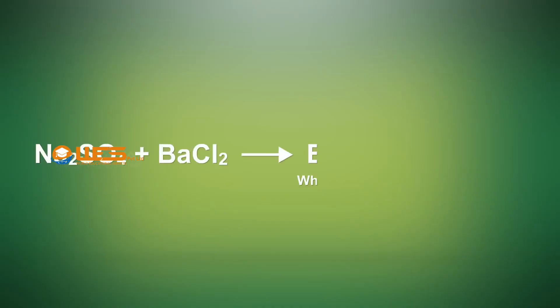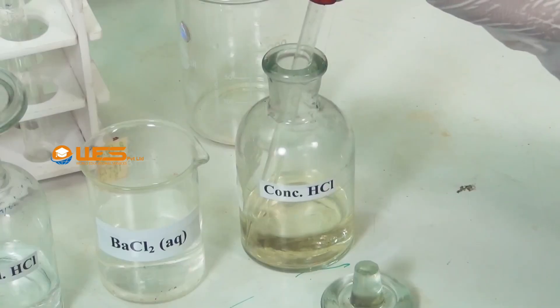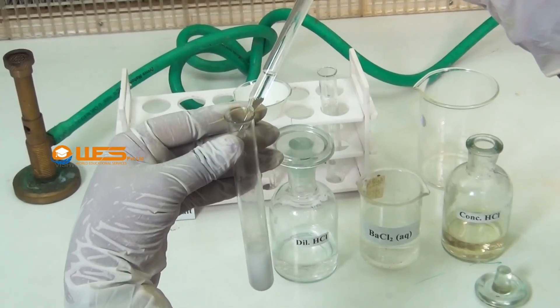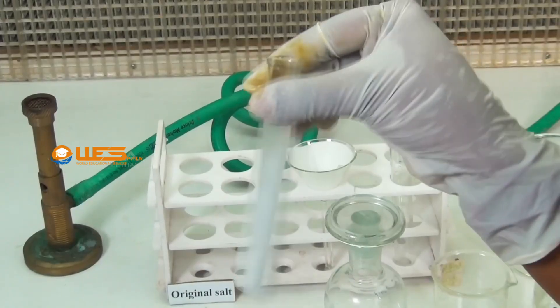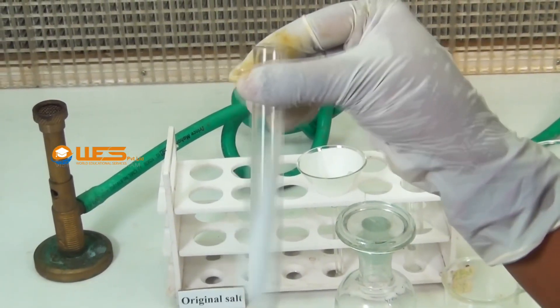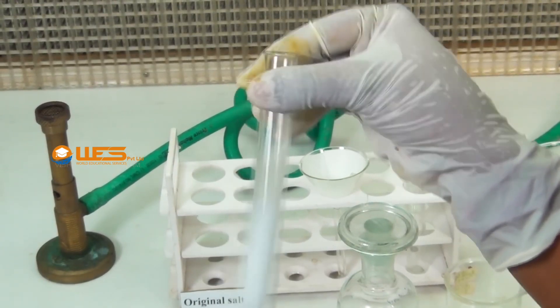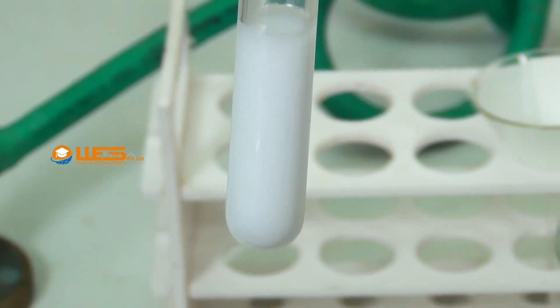Sulphate reacts with barium chloride to form a white precipitate of barium sulphate. Using a dropper, add a small amount of concentrated hydrochloric acid to the white precipitate. Shake the contents of the test tube well. The white precipitate is insoluble in concentrated hydrochloric acid, indicating the presence of sulphate.